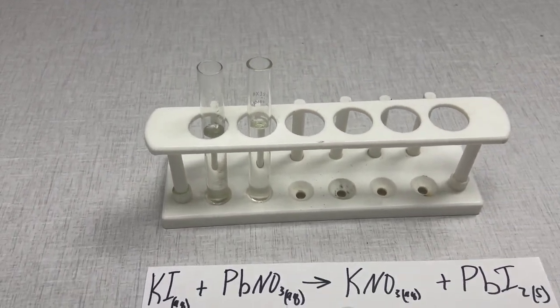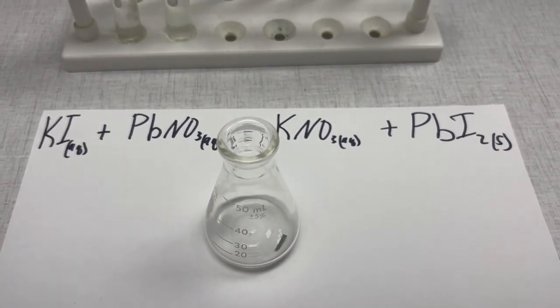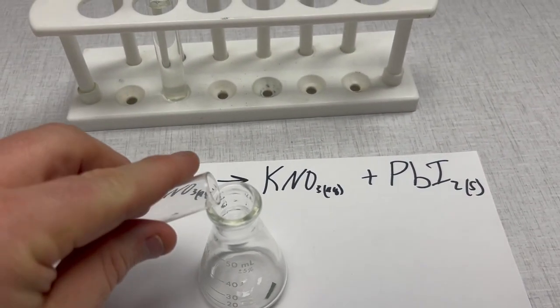Now what we're going to do is we're going to put them together into this flask and we're going to see what happens. So first we'll put the KI in.